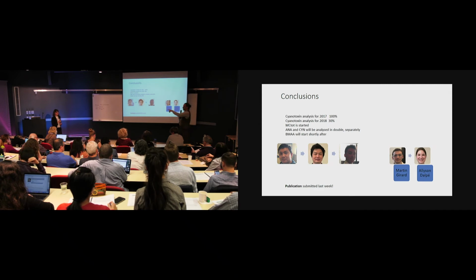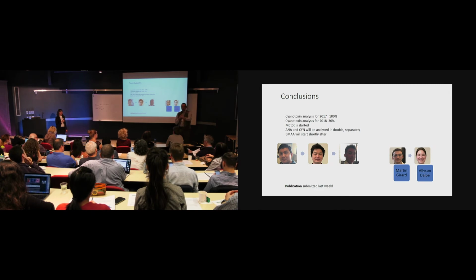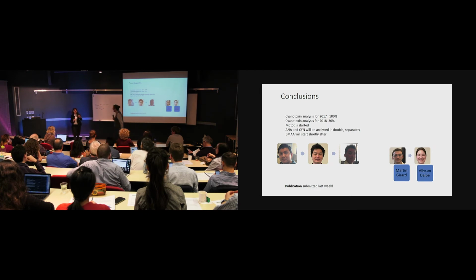The trick that we're really trying to solve is how can we use, and basically the detection limits for 2018 are going to be better than 17, and how can we handle what's in between LOD and LOQ? We know it's there, but we don't know exactly how much is there. We can't put a number on it, but it's valid information, and we need to figure out the right way of using it. We probably need to move on. Sylvie had a question.